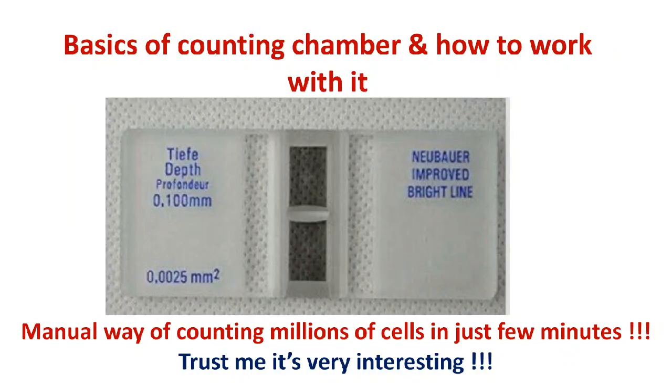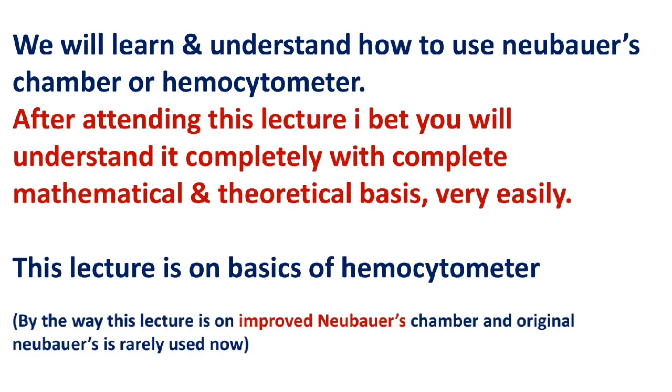In this video, we will learn and understand how to use a counting chamber, or hemocytometer, or Neubauer's chamber, in a highly easy and logical way. Please watch the video till the end, and I assure you that you will understand the logic and math behind it. Your concepts will be 100% clear, and trust me, it's very interesting.